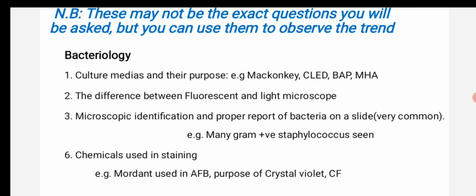This is also a very important thing. We have to identify which microorganisms are identified with the light microscope and with the fluorescent microscope. So this is very important. Another thing is we have to identify and report the bacteria on a slide.